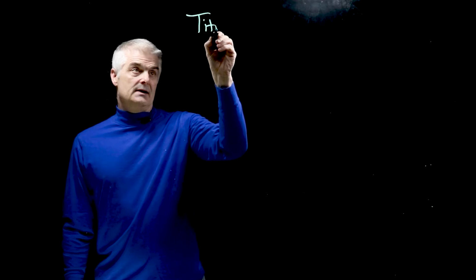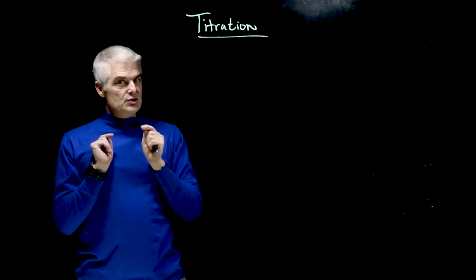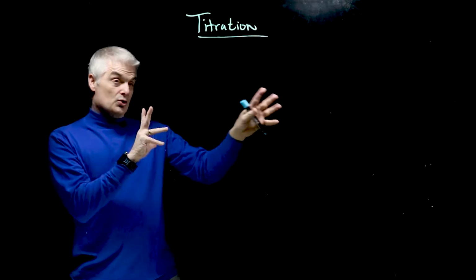So the bulk of this video is going to be teaching you how to do a specific technique in the lab, and it's called a titration. Now, before we talk about a titration, there's some really important definitions that you need to understand and know so that we can talk about this.